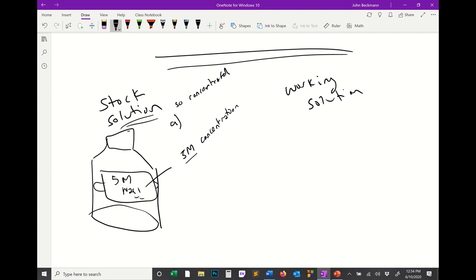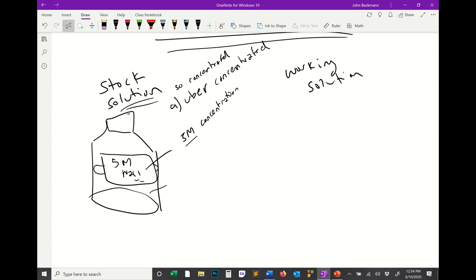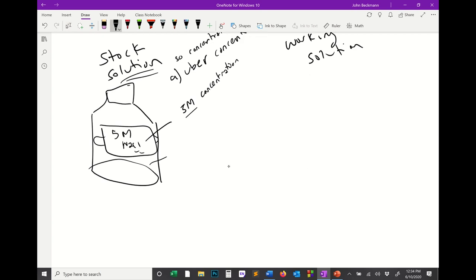So what makes a stock solution? Stock solutions are usually uber concentrated. It's so concentrated, in fact, that you're usually not going to be using this directly in any actual experiments, okay? So usually you take a stock solution and it usually is converted into a working solution, okay?